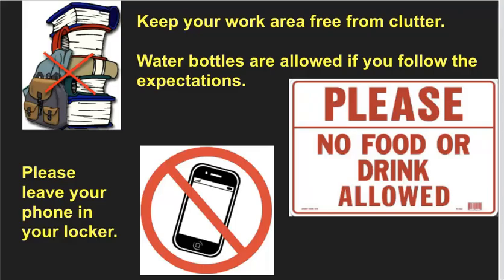And then please leave your phone in your locker. If you have to have it with you and administration allows that, then please make sure you have it off and away. If you have it out and you're playing with it, then we have to deal with it in a different situation. You should not need your phone to take videos or pictures or anything like that during lab time.